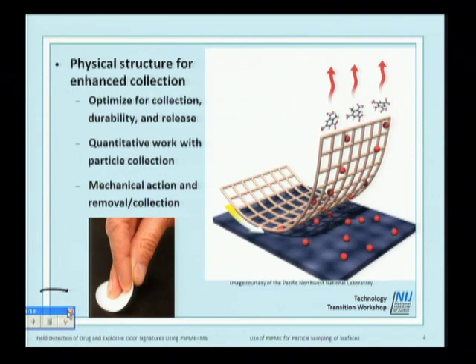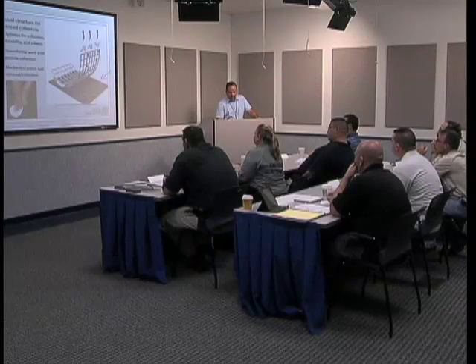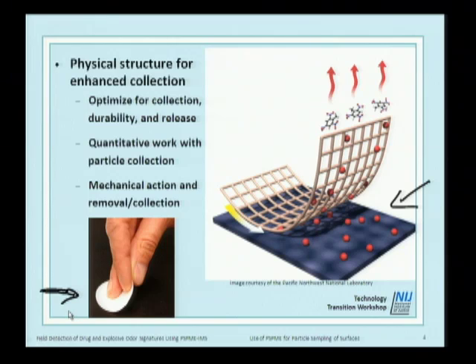So there's been a lot of work here in the amount of force and the way that people remove samples from surfaces. And here's a little cartoon of having particles on surfaces. You get the particles onto the substrate, and Patty already said that the composition of the substrate plays an important role in how well you remove the particles.